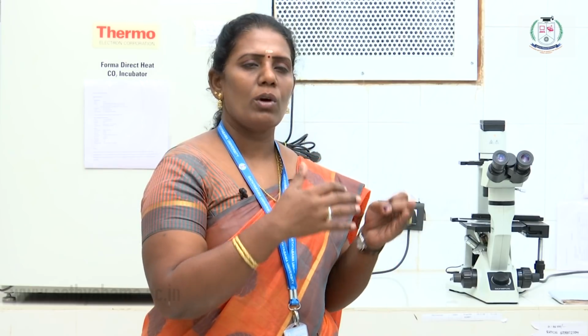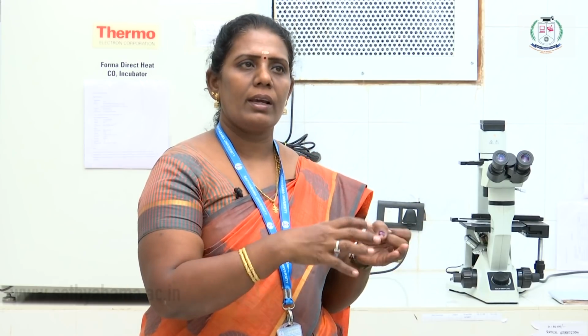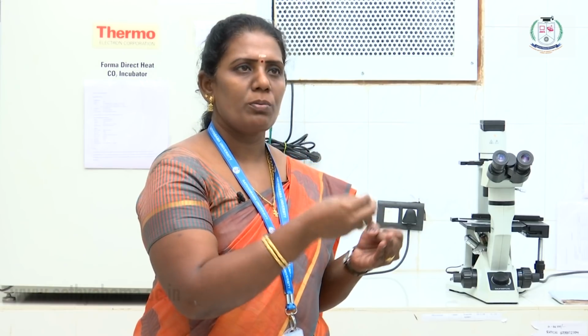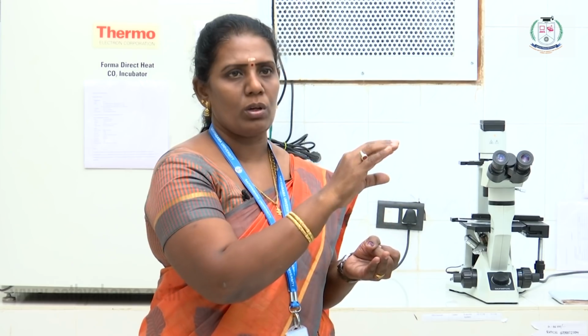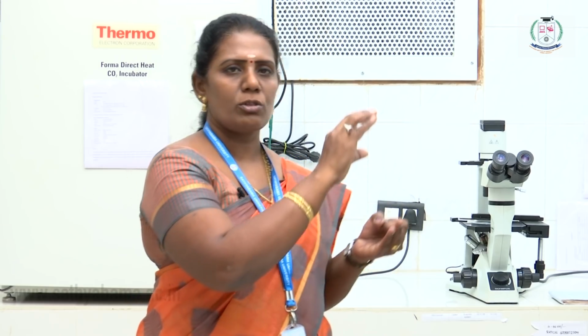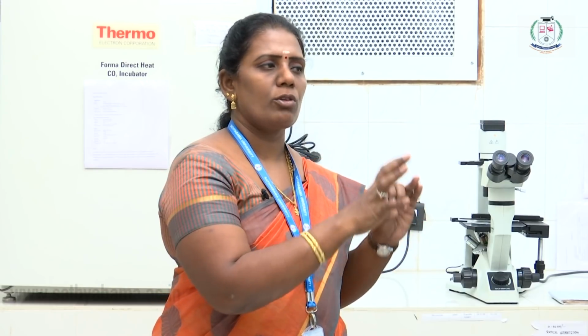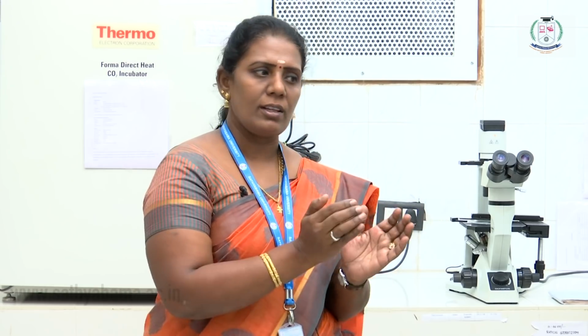The place where you are performing all the work, like converting tissues to cells, or feeding the cells with material, everything will be done in the laminar hood, because we have to prepare the growth media and it has to be present inside the laminar hood. Whenever we want, we will add it over there, and we will prepare a fine work table. Followed by this, we keep all the cells with the respective media and factors into the CO2 incubator. This is where we will be storing them, just like a home, where they will sit and grow.